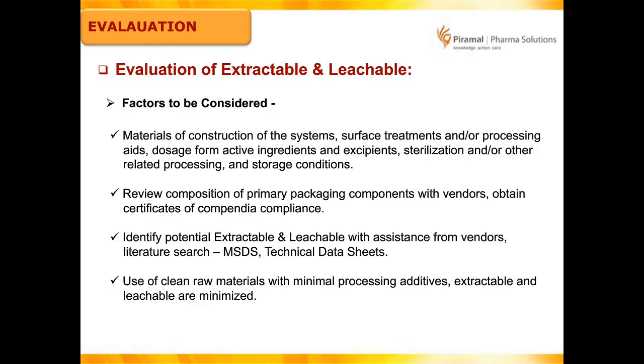When we conduct any extractable study, it is very important to understand whether the vendor is providing all these details. If not, then as the owner of the product where we are using the rubber stopper from that particular vendor, we need to ask for the certificate of analysis where the extractable information is present.